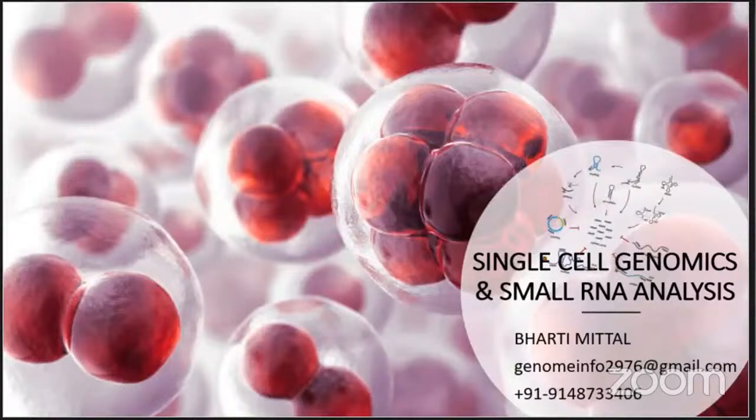So we'll begin today's session, and today's session is on single cell genomics and small RNA analysis. As the name itself indicates, we are going to talk about single cell genomics. So whatever the nucleic acid contains, whatever the genomic aspects are present in a single cell, we are going to look at it. As well as we will look in brief at what small RNA kind of analysis we could do. Because in our previous sessions we conducted transcriptomics, but we didn't cover small RNA. As today we are going to see single cell, and it is more or less a similar kind of analysis, we will cover small RNA analysis as well.